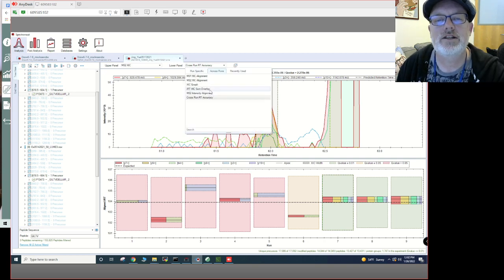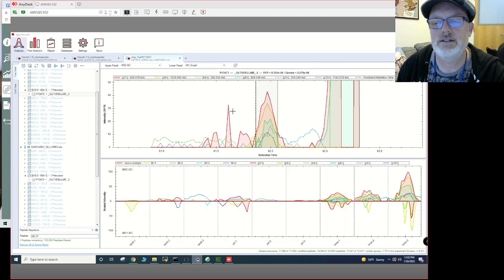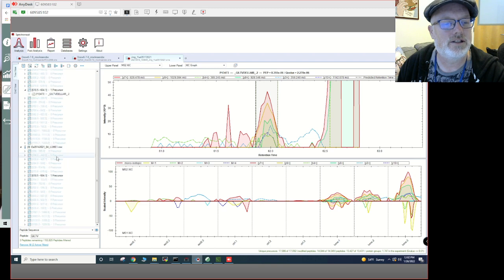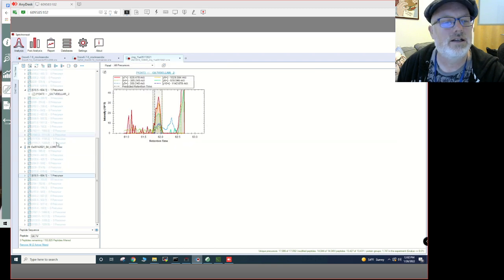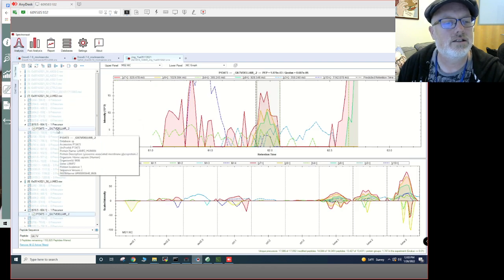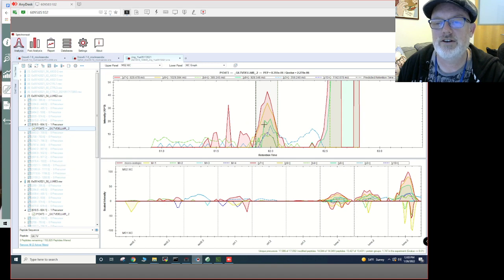We also want to look at, I believe it's the XIC graph. Doesn't look so great on the MS1 intensity, but we see very good signal for the MS2 intensities. They all kind of line up. There's no real evidence here. I'm pretty happy with this result. So it looks good. Everything looks good. I don't know why it didn't turn out the last time, but I'm pretty happy with this.